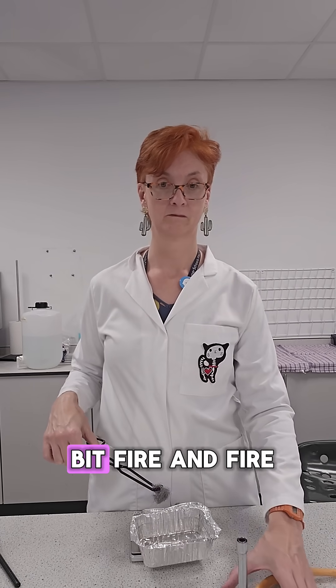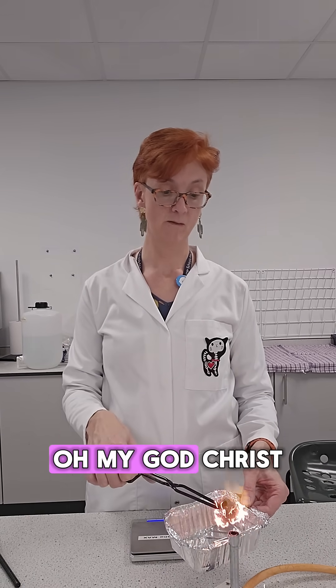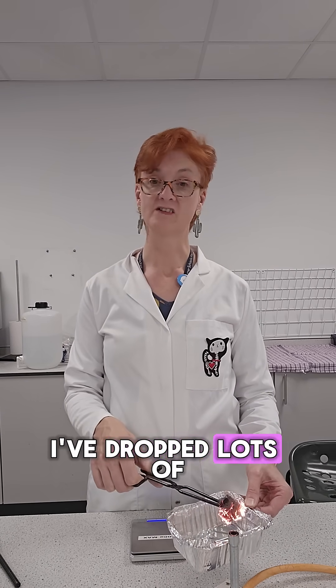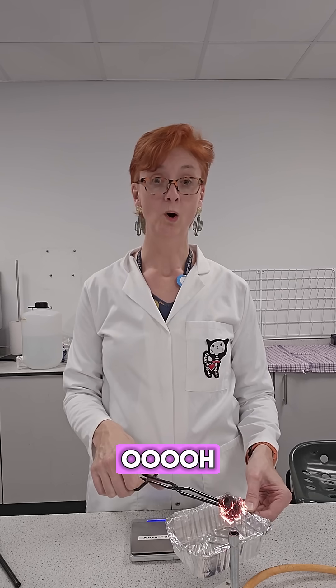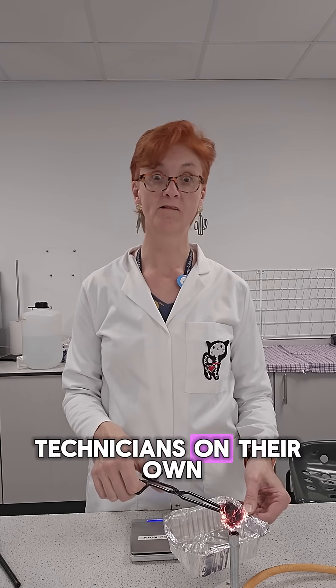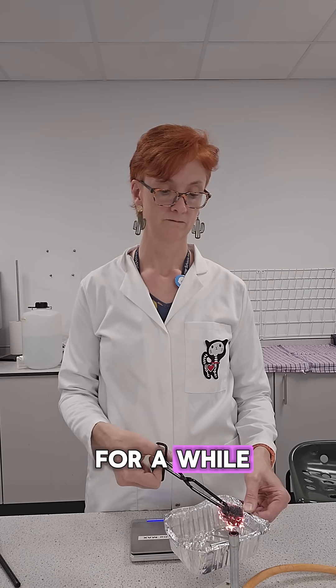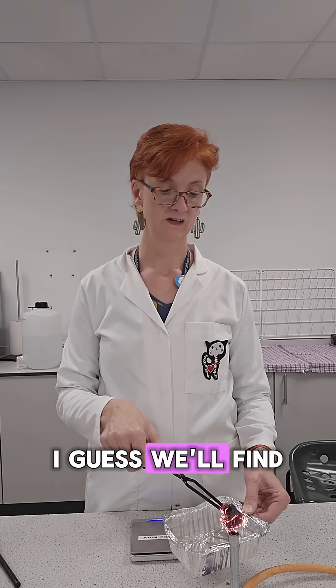Can you even see that? Fire. And fire! Oh my god! Christ! I've dropped lots of it, so this might not work. It burns! This is what happens if you leave science technicians on their own. Burning. It kind of burned quite a while. Is that long enough? I guess we'll find out.